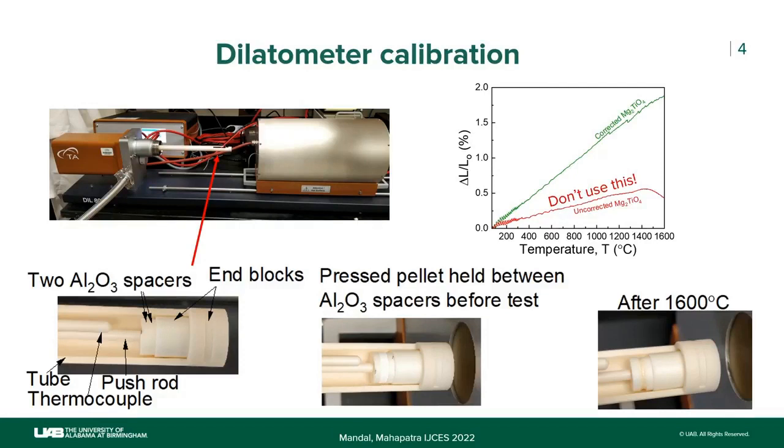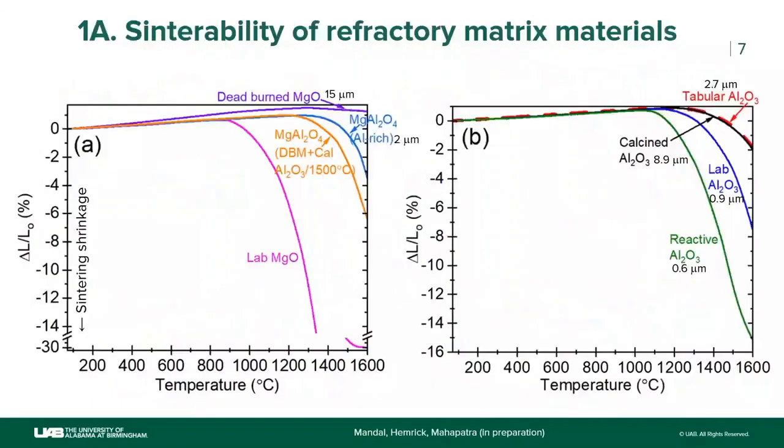But again, whenever we fire bricks or castables, we limit it to plus or minus 1 or 2% expansion or contraction, right? So you won't see that much difference. Again, you see this raw material. Look at this y-axis. This is like 14%. This is 6%, 7% changes. You need to magnify your y-axis to see the changes of the raw material. That's why we do this test separately for individual raw materials, and then probably you can buy a bigger dilatometer and put your castable or brick directly in it and see how they interact.